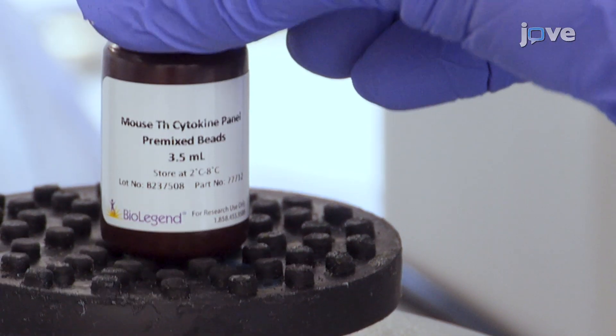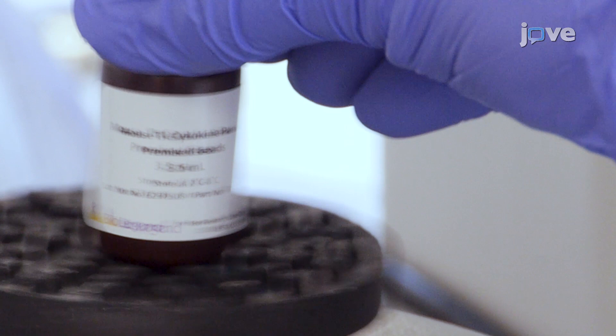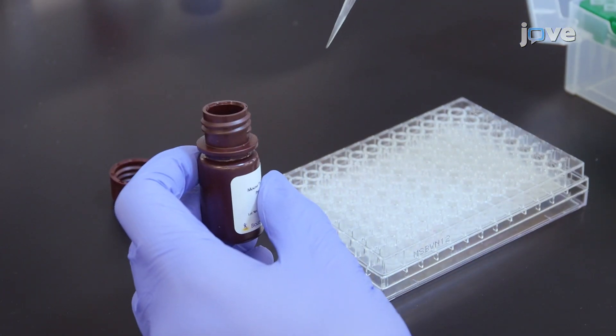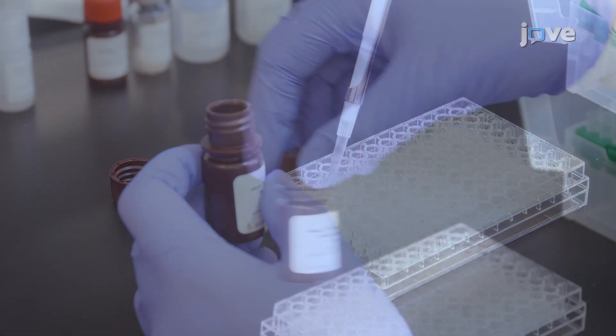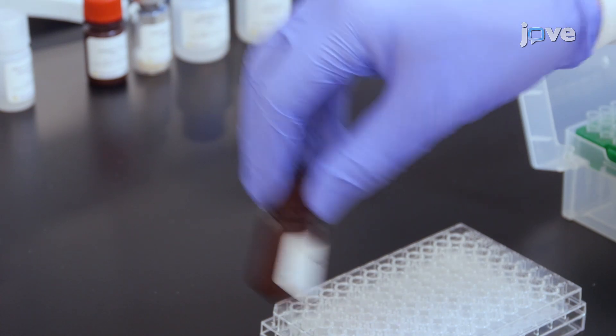Vortex the mixed beads for 30 seconds. Then add 25 microliters of the mixed beads to each well, shaking the bead bottle intermittently to avoid bead settling.